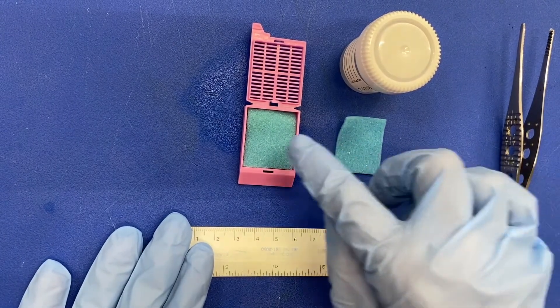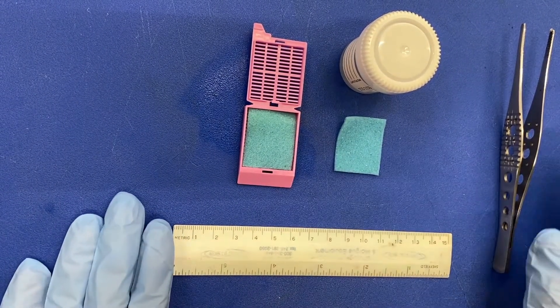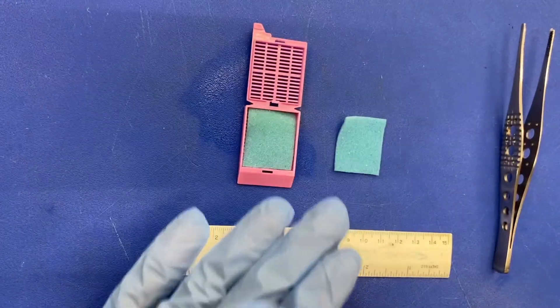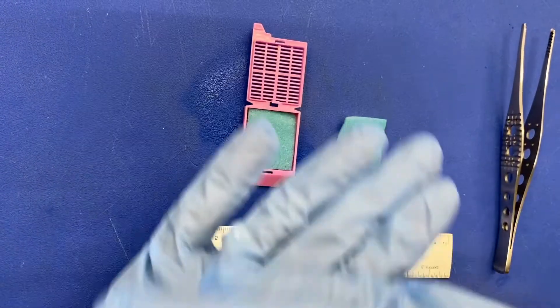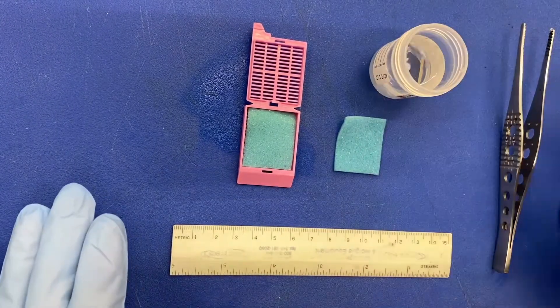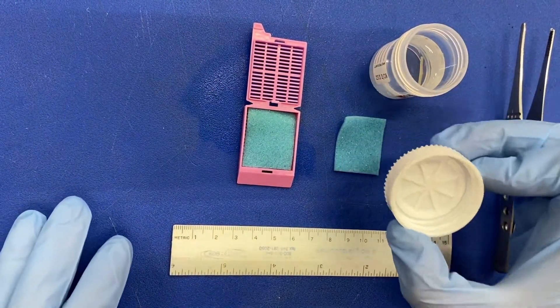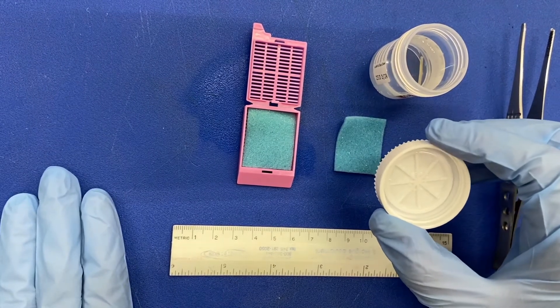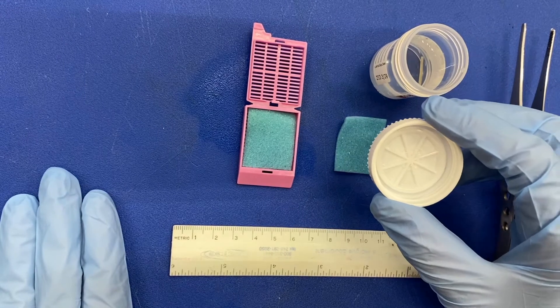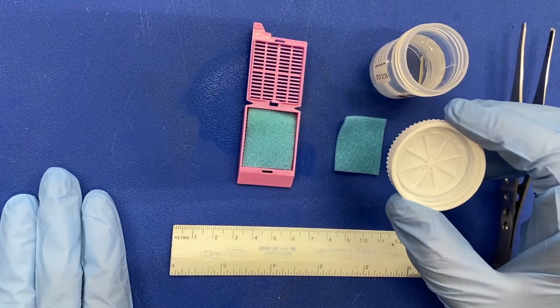First, open the container. Check the lid of the container for any adherent tissue that may be present there. Then look inside the container to find the specimen.